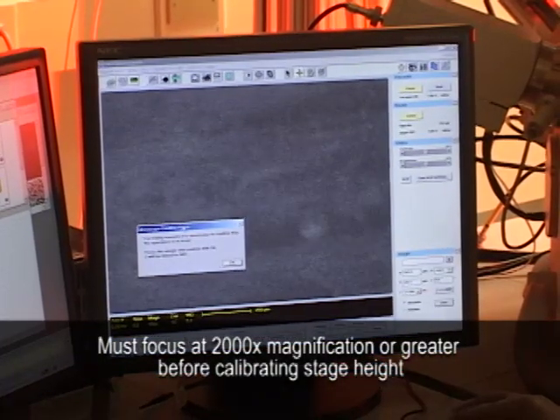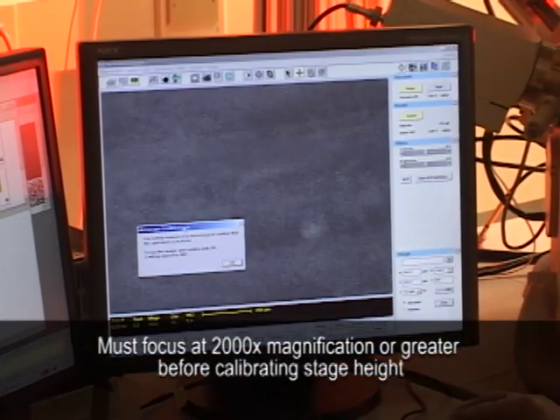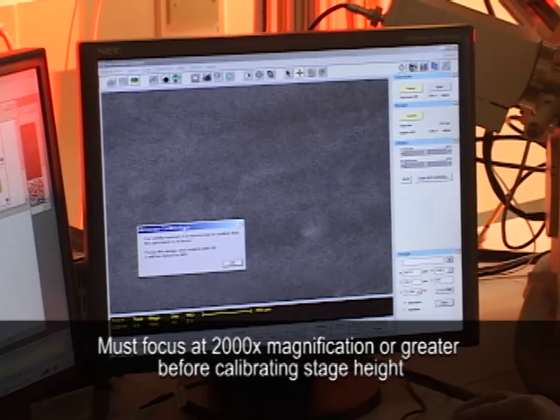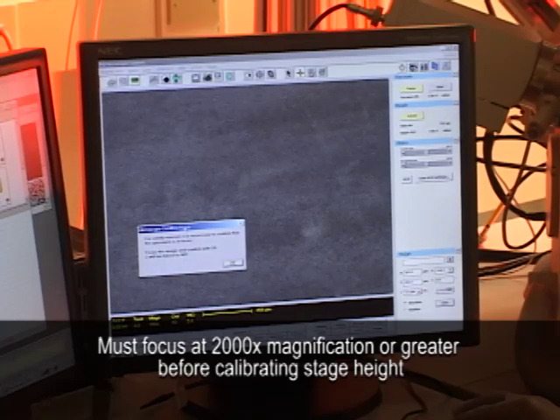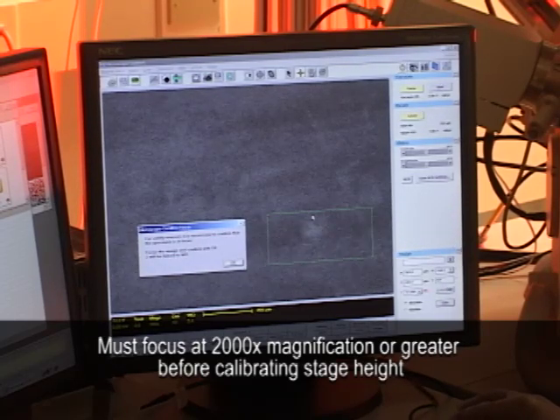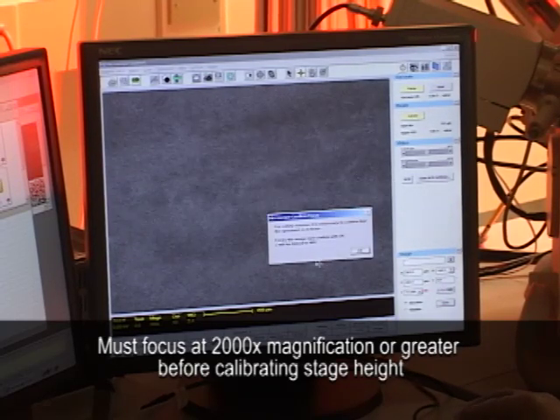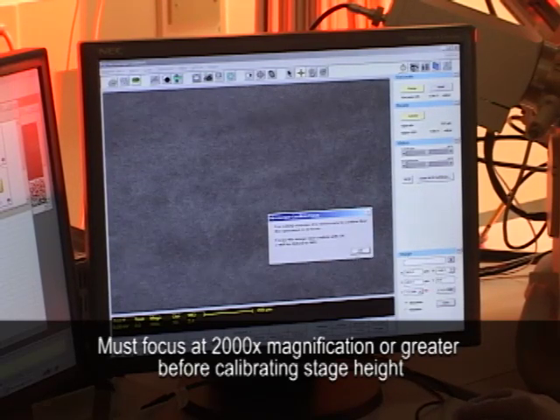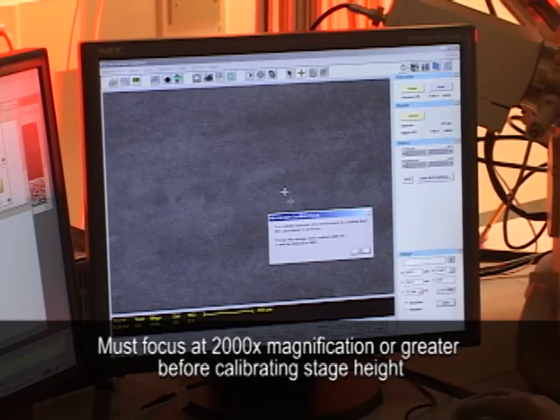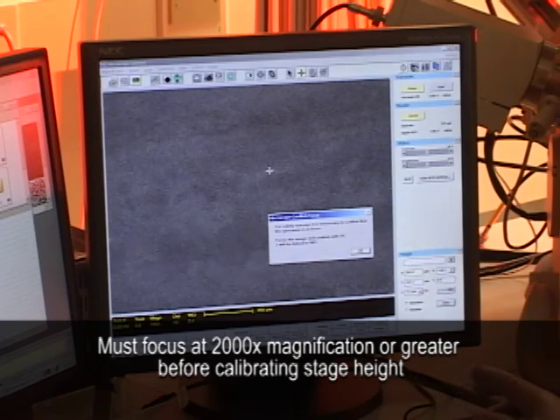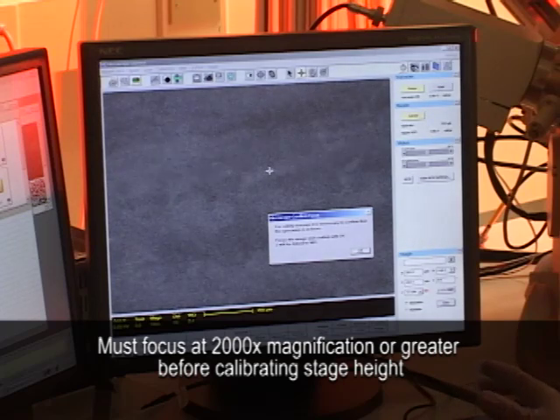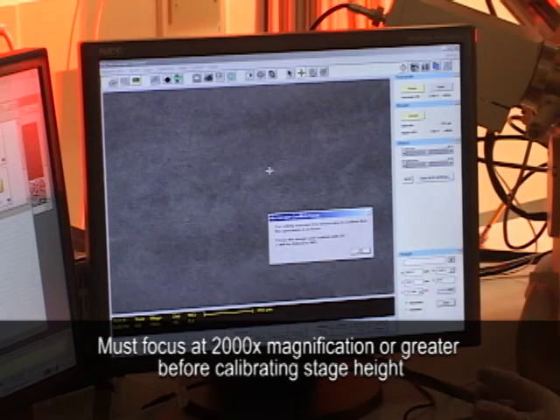If this message box is in my way, I can remove it to another monitor or move it to a different position. But I'm not going to click OK until this sample is in focus at 2000x magnification or greater.